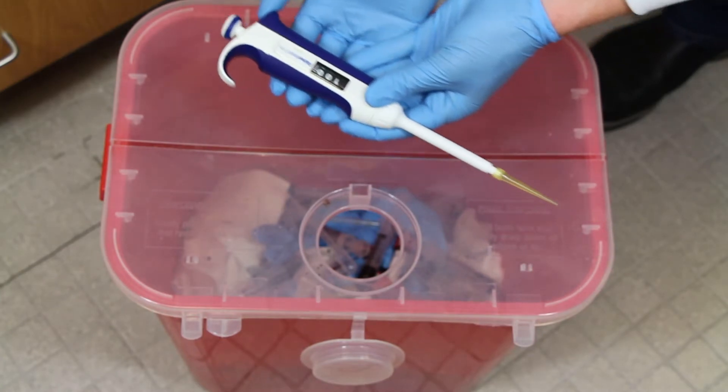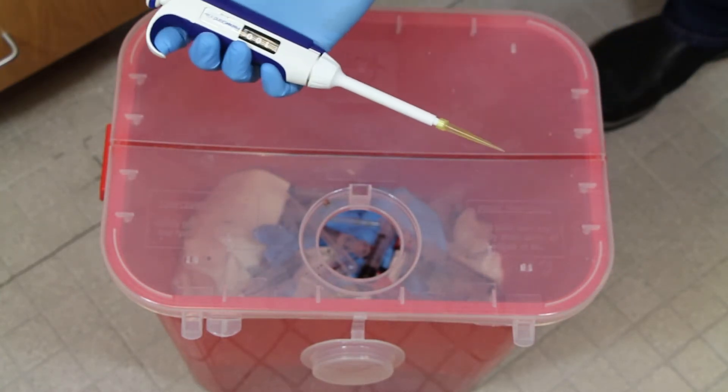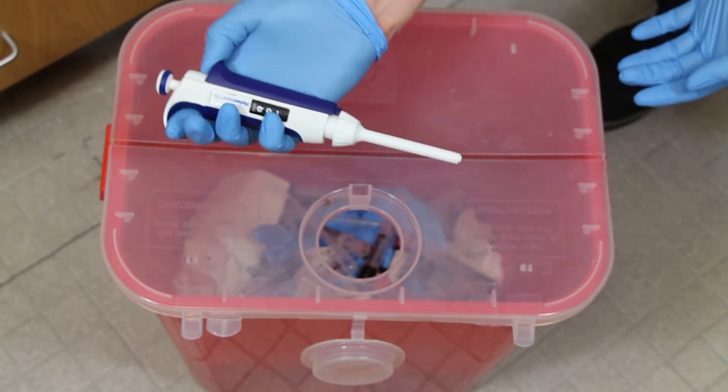Once you're done using the pipette tip, simply take it off of the device by pushing on the little eject button. That's going to push down the outside of the pipette, which pushes on the pipette tip and pushes it right off the end into whatever trash container you're using.